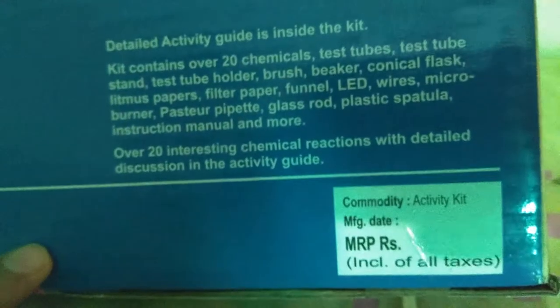You can read by pausing the video what is written here. Here also something is written. Chemistry set for students. MRP rupees is not written here.